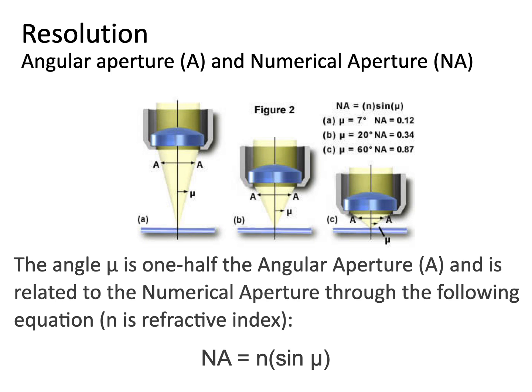And this is one reason why, as a teacher, we always tell our students to start with the scanning objective, the 4x, the weak one. Because if you start with a higher one, your objective and sample might crash into each other as you're trying to switch slides. So give yourself some space to work. So start with that lower power objective.